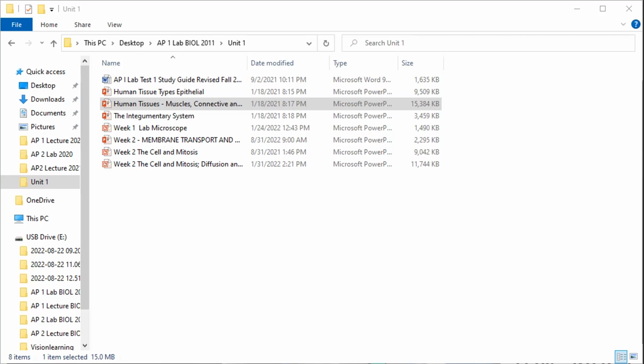So we also have adipose, I mentioned that. Okay, here we see these are the various layers of the epidermis. The stratum basal layer is the layer right above the dermis, the epidermis. Stratum basal, for basement layer, that's where we have living cells. Directly below that is where the dermis starts. So we have living cells in this very bottom edge here. This little purple band here is the living area.